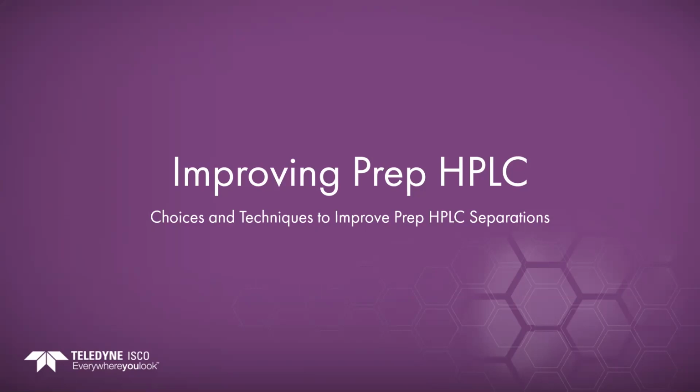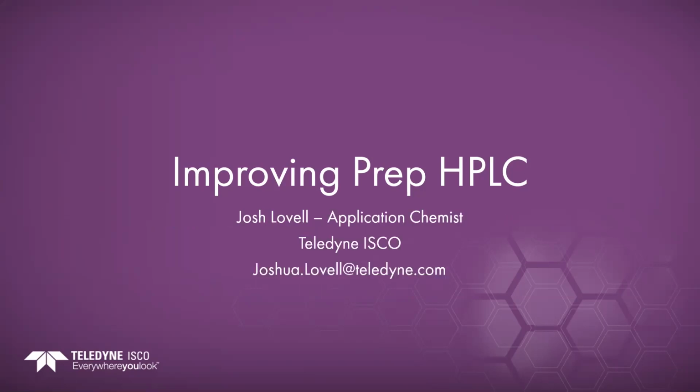Thanks, Sharon. So today's webinar is going to be regarding improving Prep HPLC chromatography and some choices and techniques that you can make to improve your Prep HPLC separation. There's my email address. Feel free to reach out to me via email if you have any questions regarding this webinar or any other application associated questions.